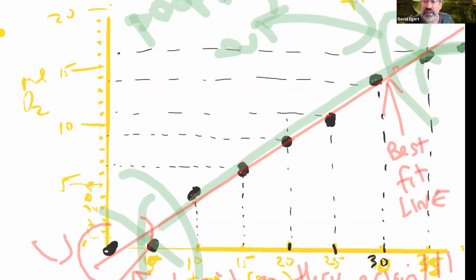So this is the first step. The first step is plot it out in a pretty graph and then draw a best fit line that you think best approximates the slope when the reaction was really going at its best, before it started pooping out here, and kind of ignoring the craziness at the very beginning.